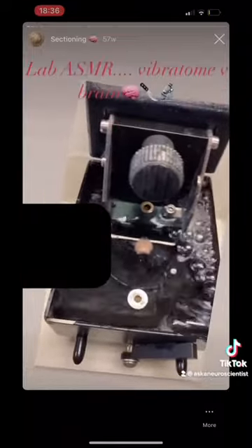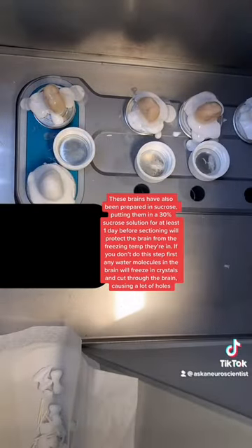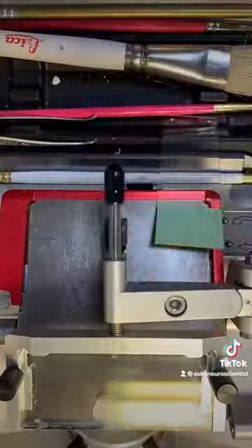Here I'm getting the brains ready. I put them on that chuck I mentioned earlier, and then I'm putting some OCT on it. OCT is a sectioning compound that's going to protect it whenever I section. Then I very quickly slice down to the area that I'm actually sectioning.